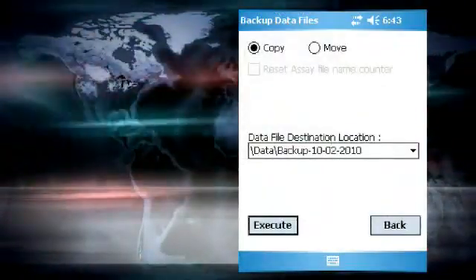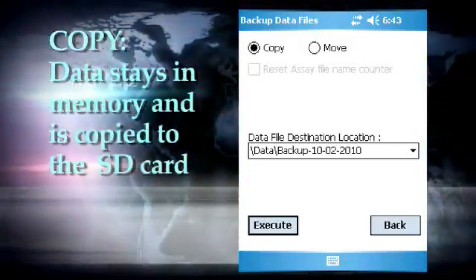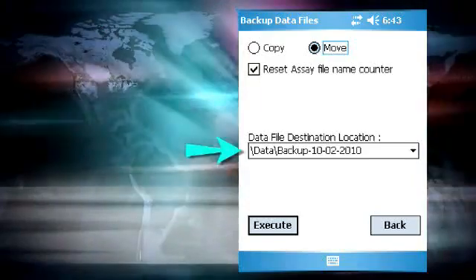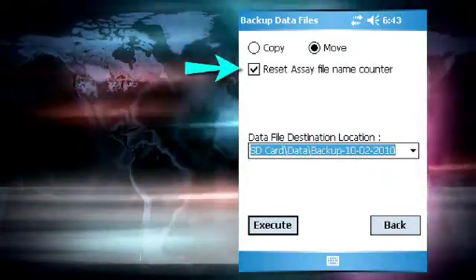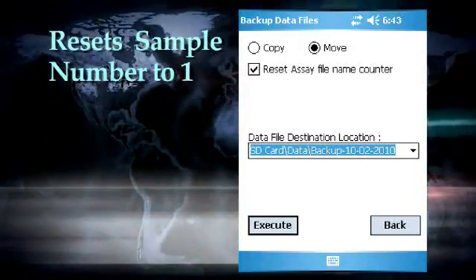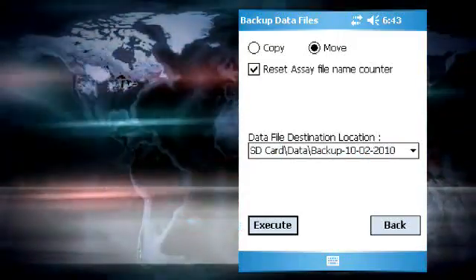In the backup menu, you can choose to copy or move the data. If you copy the data, it will remain on the PDA memory as well as creating a copy on the SD card. If you move the data, it will be deleted from the PDA memory. The destination for the move or copy is chosen in the drop-down list in the middle of the screen — make sure to select the SD card as the destination. At this screen you will also have the option to reset the sample name counter so that the next sample will be numbered one, which is recommended for the move operation. When all settings are prepared, tap execute to transfer the data to the SD card.